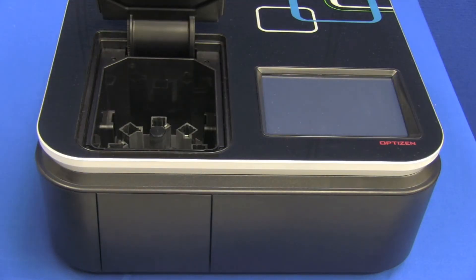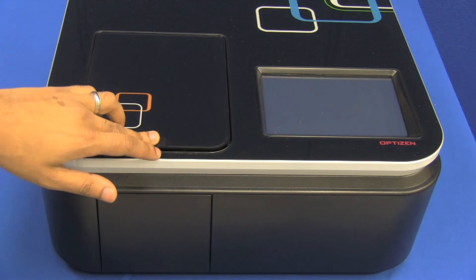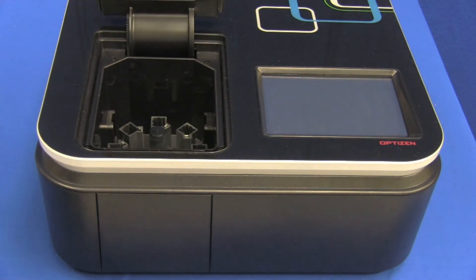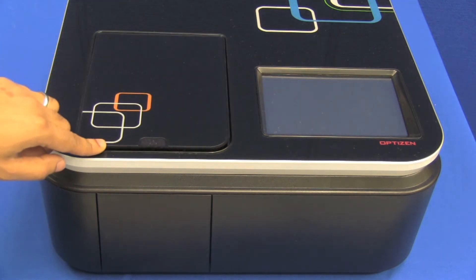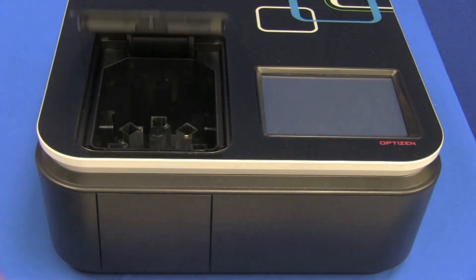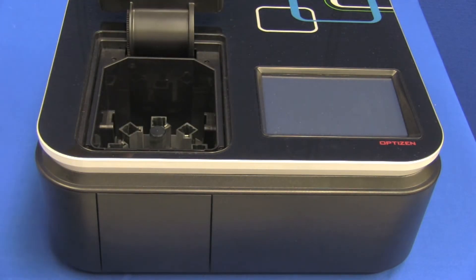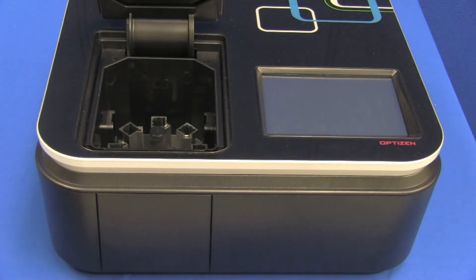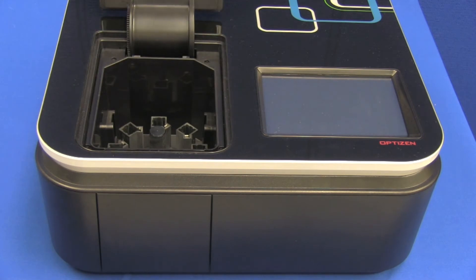A nice feature that the Optus and Pop has is its soft-touch movement. This might seem like a small detail, but the fluid movement would probably allow for a little more longevity when it comes to the use of this device. You can imagine that slamming the door open and shut can quickly shorten the life of the instrument, so having these soft movements probably increases the life of the instrument.